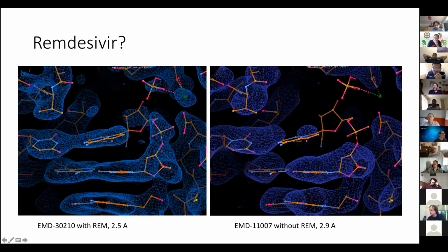And we don't see this connecting density here. As Alan mentioned, this is probably not the best cut, but I just took these two cuts. I haven't calculated the difference map. If I want to do that, I really have to scale the densities, so I haven't done that yet. It's just the resampling and then fitting.